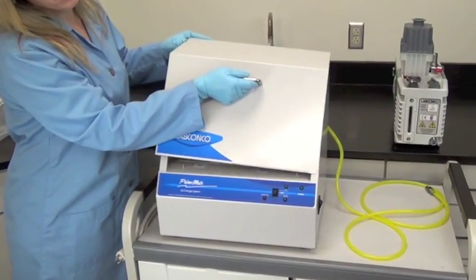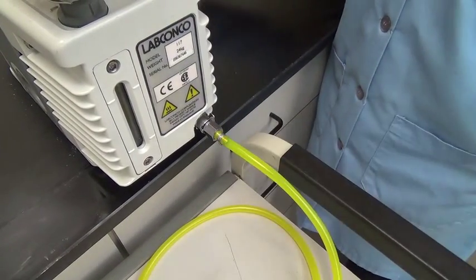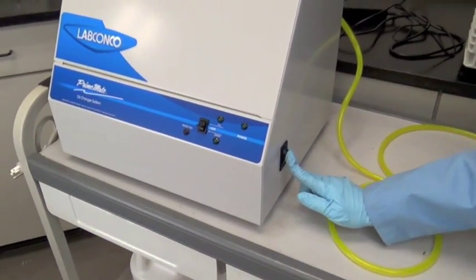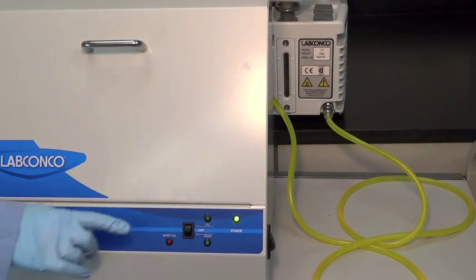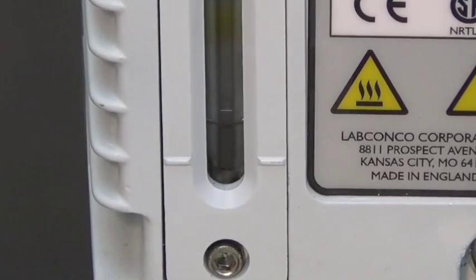The Primemate and vacuum pump are now ready. Push the hose with the quick disconnect into the vacuum pump adapter until it snaps in place. Turn the Primemate on and make sure the power light is lit. To use the Primemate for an oil change, push the switch down to drain.